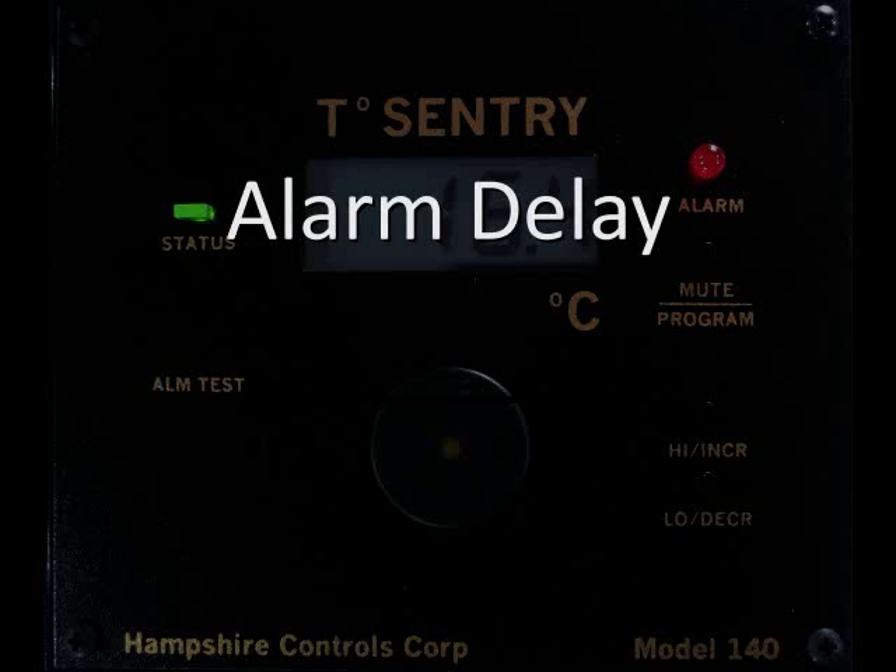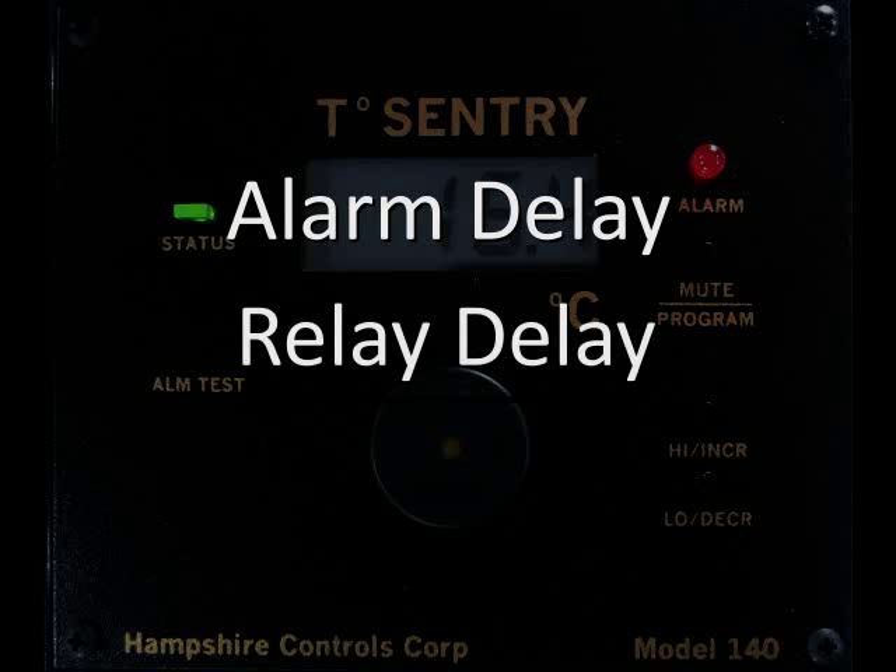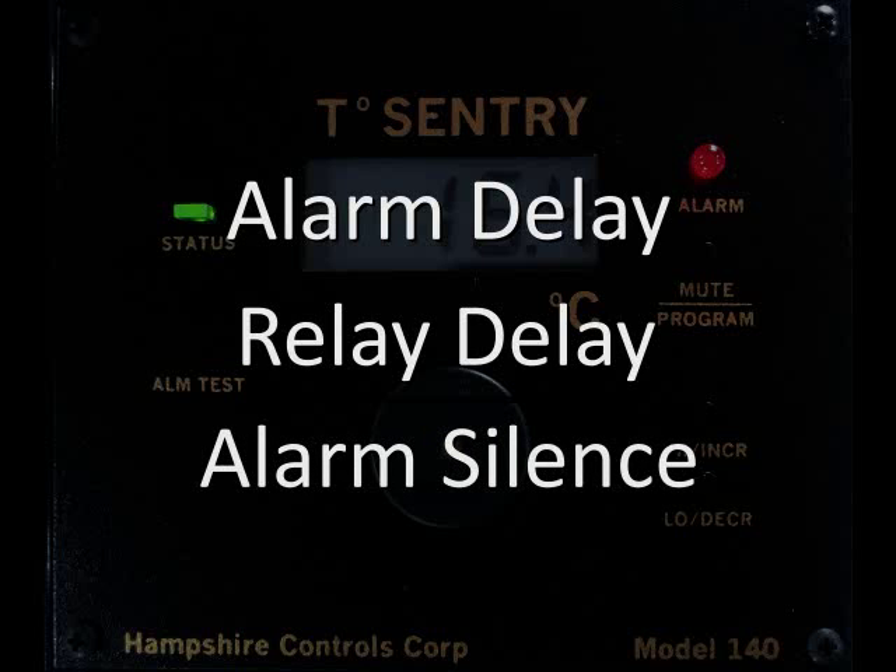Then you can set your initial alarm delay period, your relay delay option period, and the alarm silence mute period.